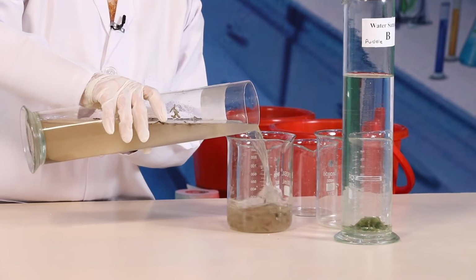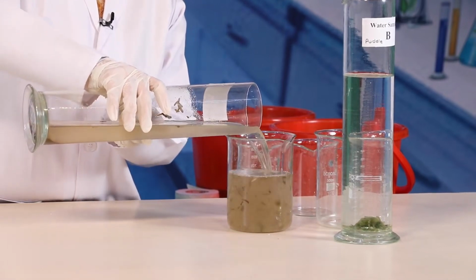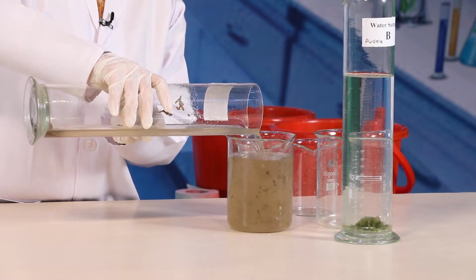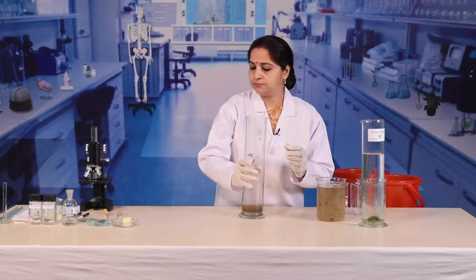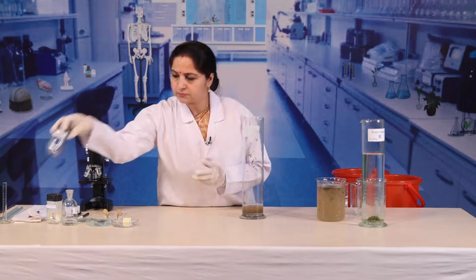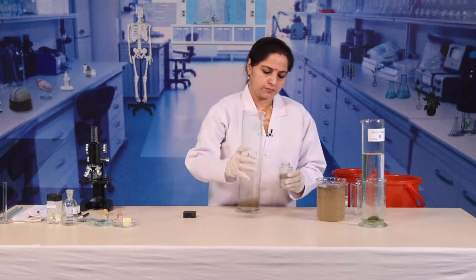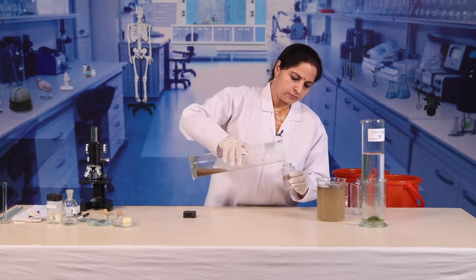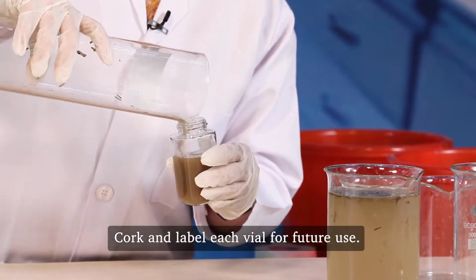Decant off the clear water, leaving sediment at the bottom. Transfer the sediment to a vial or a small test tube. Cork and label each vial for future use.